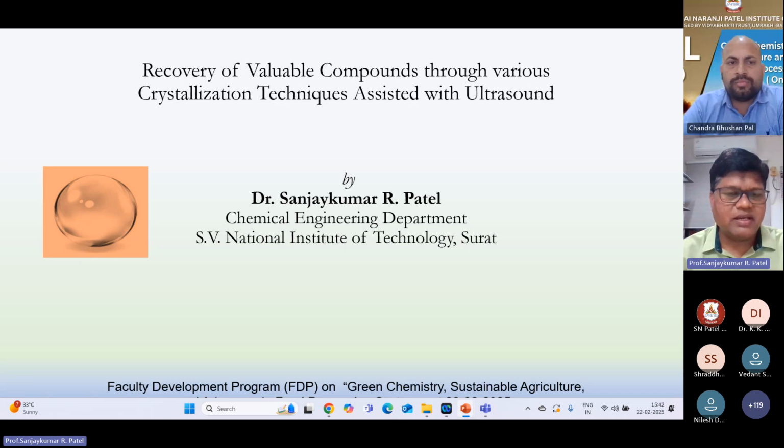Once that is over, then we'll go for some case studies that are targeting particularly the components from the solution with the help of crystallization assisted with ultrasound, and how ultrasound is proving to be a better technology for recovering of this.